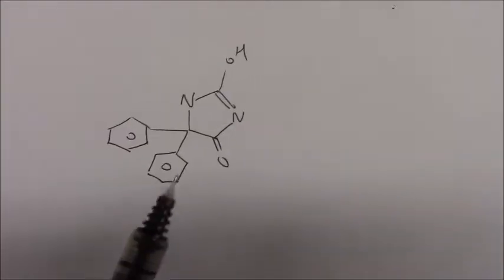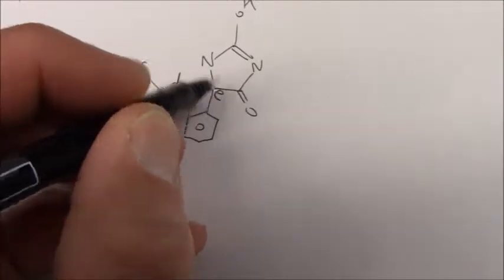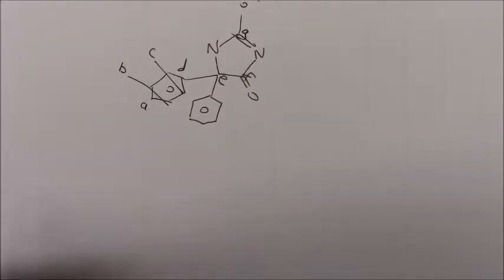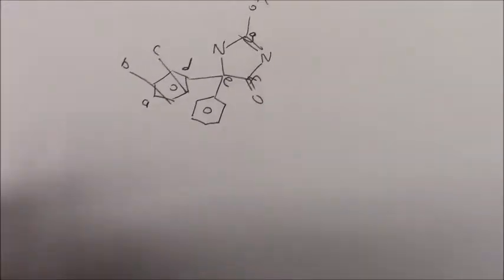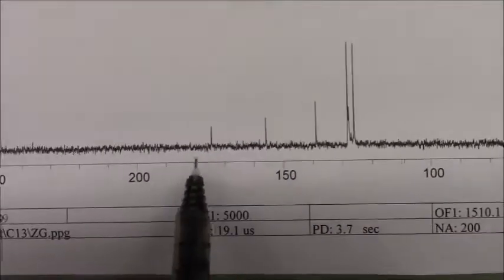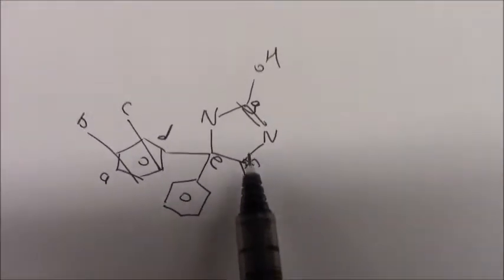Carbon-13 looks like this. I'll let you go ahead and start labeling. Well, the carbons would be A, B, C, D. Let's go with an E, F, G. So, carbonyls. Let's see if we end up seeing, if it's this structure, clearly you're going to see one carbonyl officially. And it's interesting, it's an amide one, and it shows up right here at 175. The next one is 155. So clearly the carbon is indicating this structure is preferable, quite frankly.